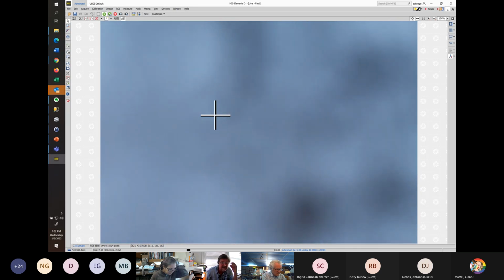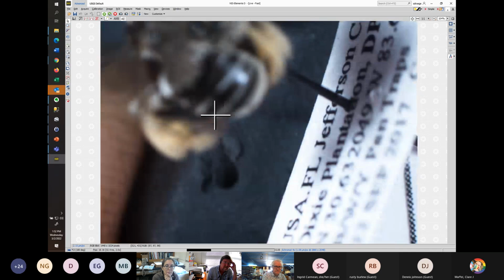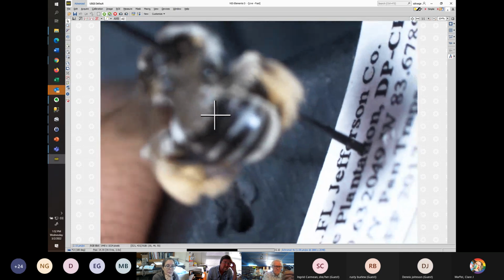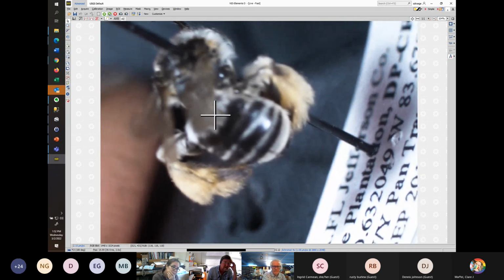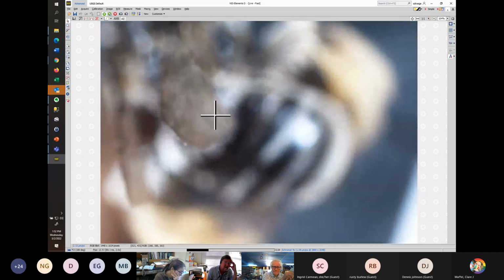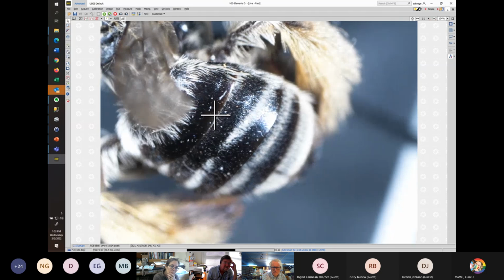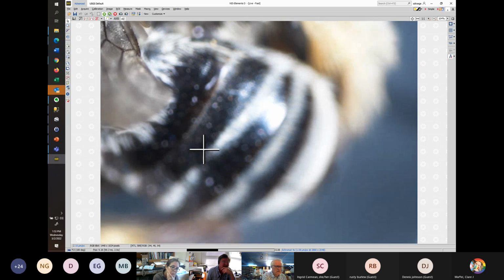Can you look at T1, Sam? Yeah. Oh, lots of hair. This area is all white hairs. Yeah, I was looking for punctures, but it's hard to see.